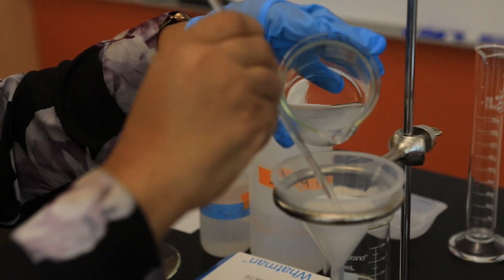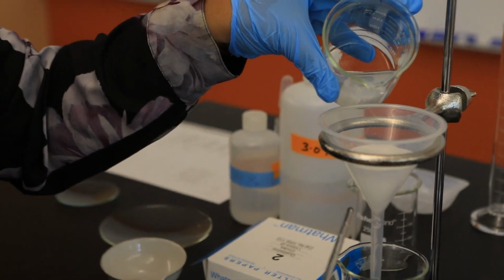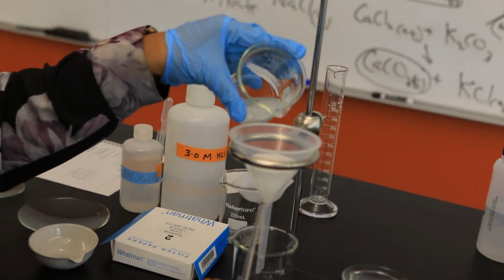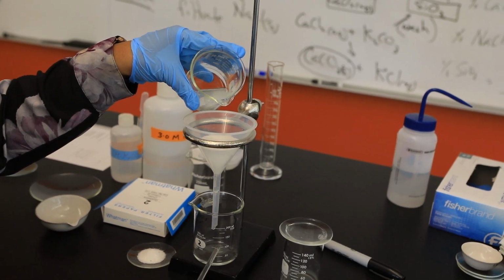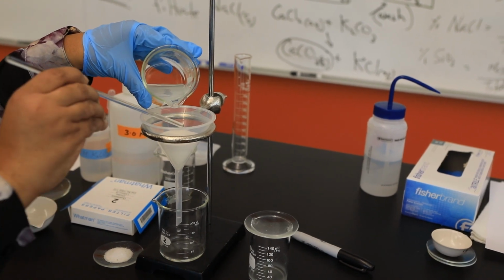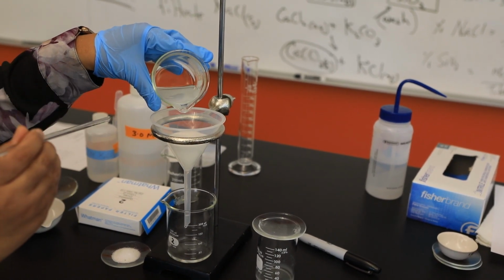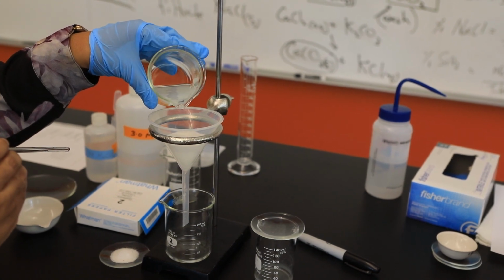You should be able to note that my filtrate is going through that porous paper. It's being collected in beaker number 2. Likewise, at the end, you're going to notice that my sand and my calcium carbonate will hopefully be on that filter paper.